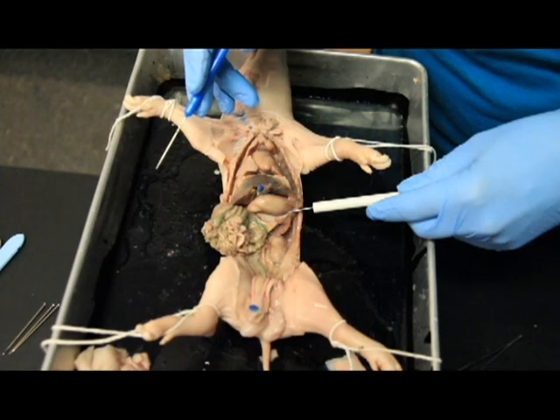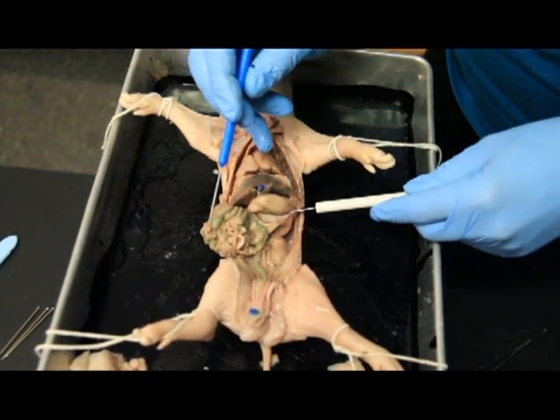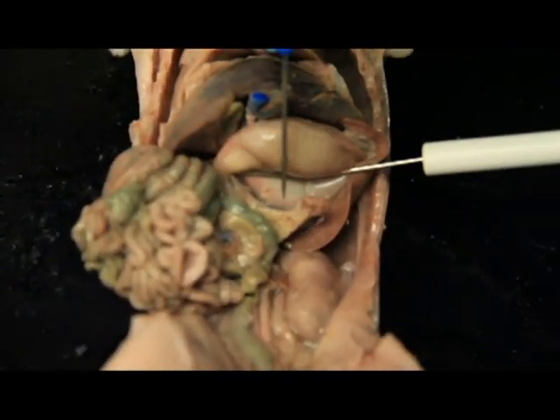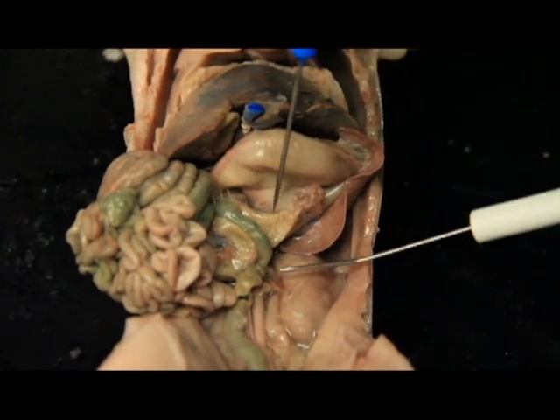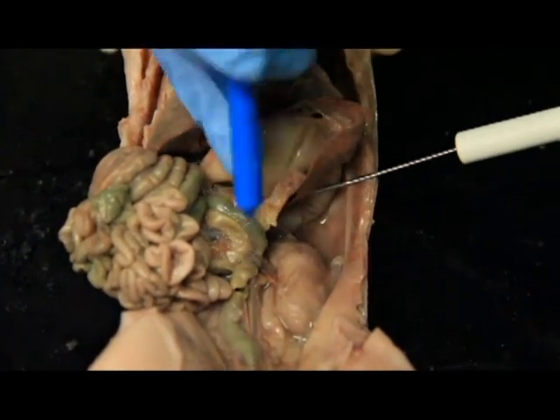Okay, so continuing on to our reproductive and excretory system. So now we're underneath the liver, underneath the stomach. This is your pancreas. Remember I said it was that white, fatty looking material? This is our pancreas. And then right underneath that, again, we've got our spleen right here.